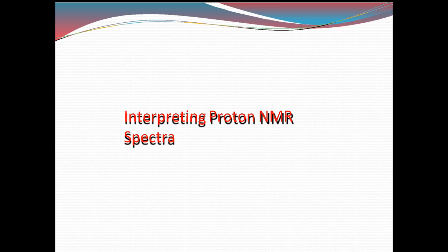For example, last class we saw mass spectroscopy. In mass spectroscopy also you will get a spectrum. So what is a spectrum? A spectrum is nothing but the graph which is given by the instrument. All this process takes place within the instrument itself. We can't know how the radio frequency rays are absorbed by the molecule, how it undergoes changes, and how it is excited from one state to another state. We don't know all these things.